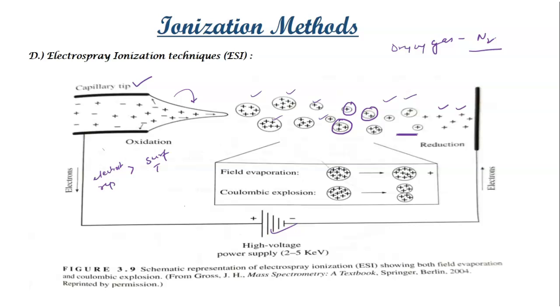Okay, understanding. And there is another method also, that is thermospray ionization, which is regarded as the cousin of your electrospray ionization technique. Okay, and what happens over there, it occurs by a similar mechanism, but it relies on the heated capillary method. Thermospray ionization is relying on the heated capillary method. Understanding what is occurring, it is using a heated capillary rather than the one with electrostatic potential to form charged droplets.